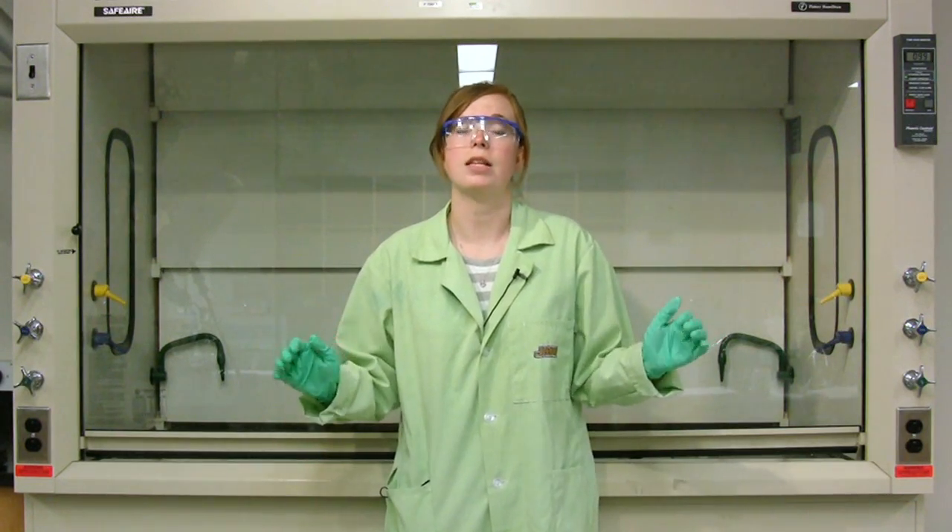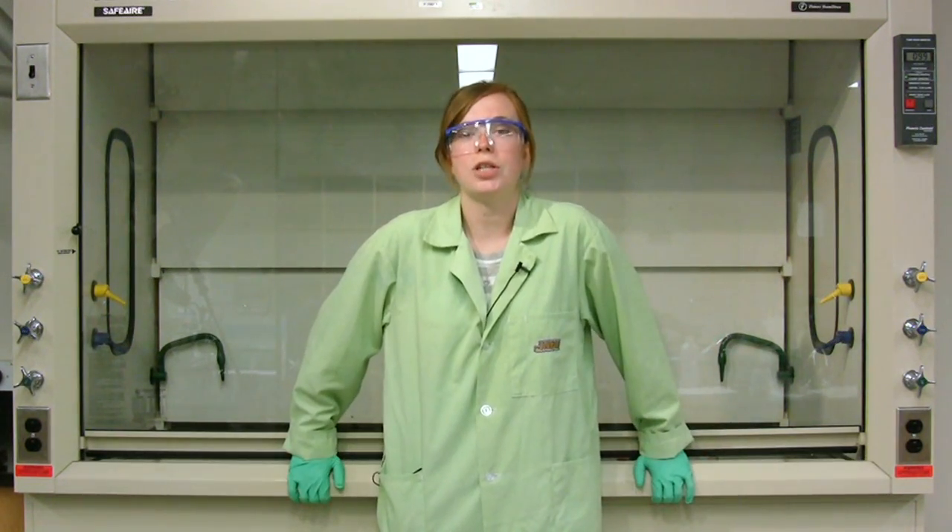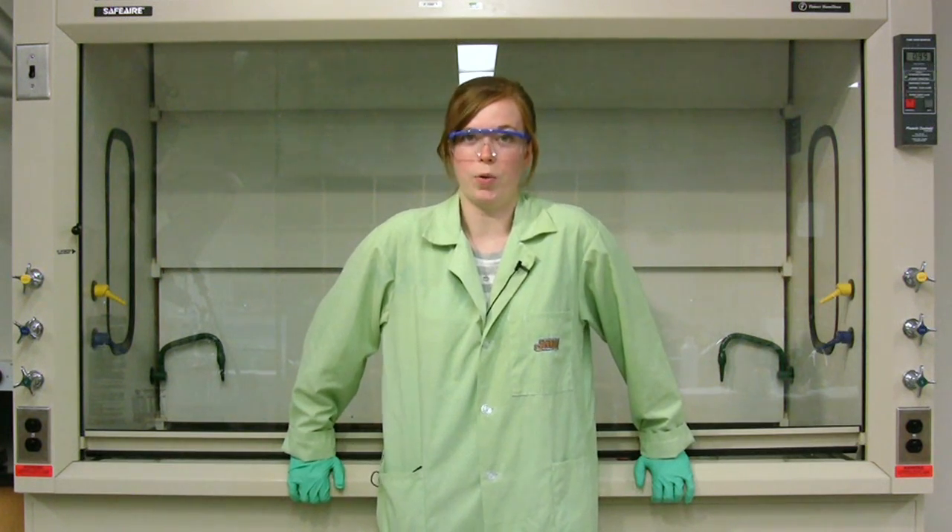The demonstration you're about to see has safety risks. Because of these risks, I'm wearing closed-toed shoes, protective gloves, and safety goggles. This demonstration should only be done by a trained professional and should not be tried at home.